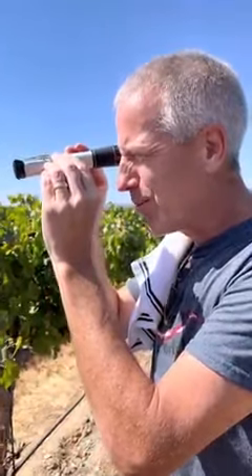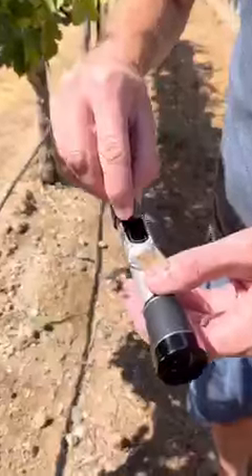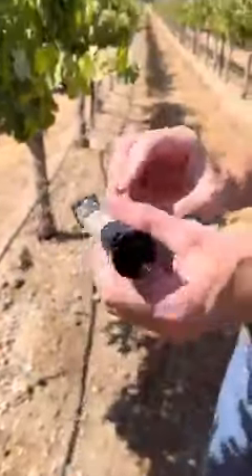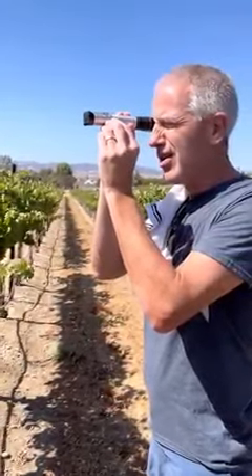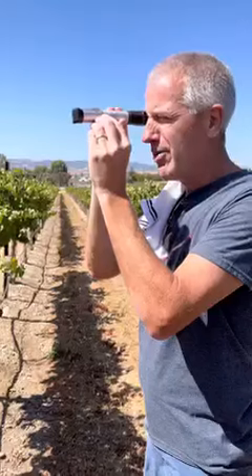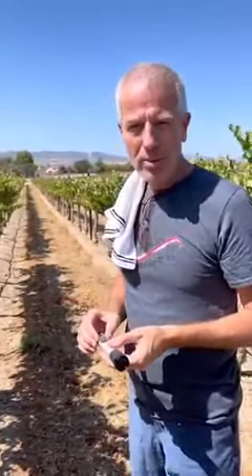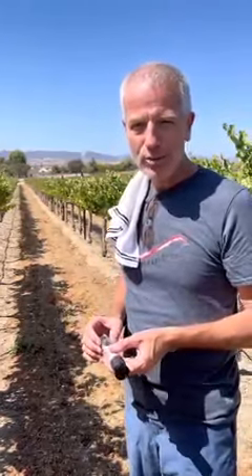That particular berry was a little over 26 Brix. Should be harvesting probably within the next two to three weeks, right on schedule for this vineyard, right around the first week of October.